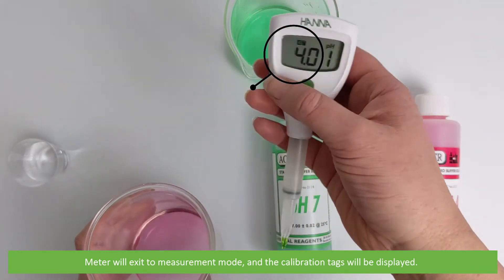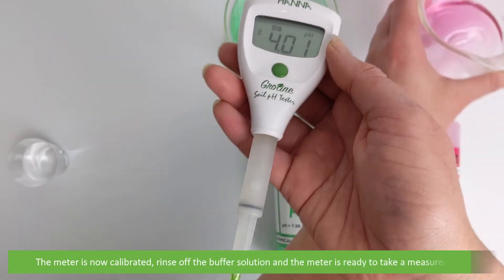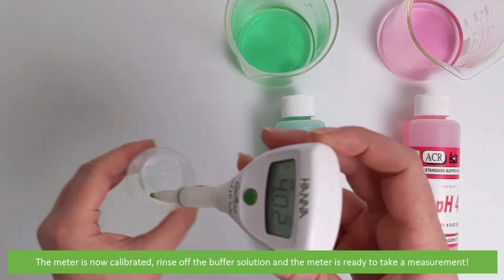The calibration tags will be displayed. The meter is now calibrated. Rinse off the buffer solution and the meter is ready to take a measurement.